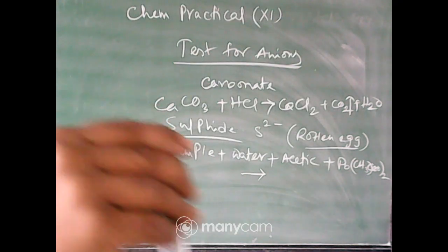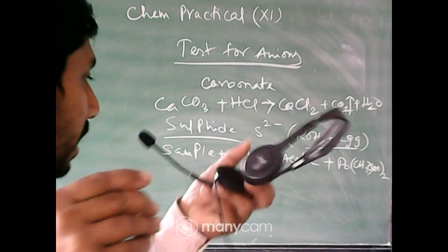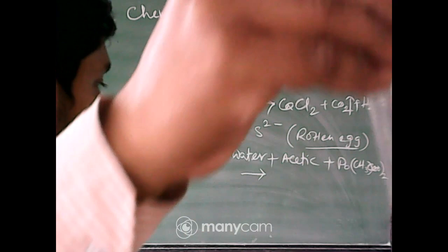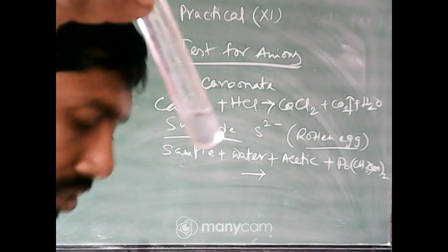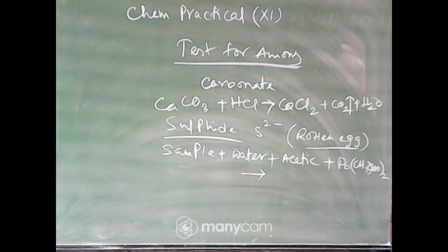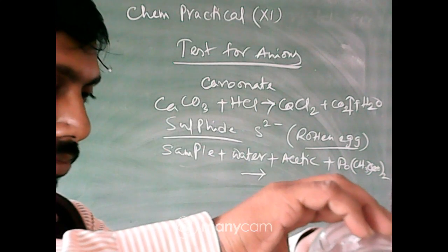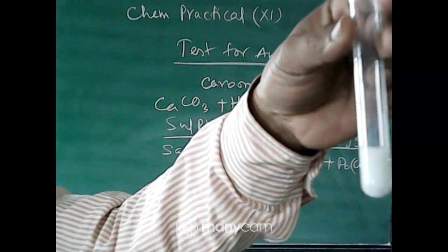Now here I will add acetic acid and then lead acetate. This is acetic acid. White PPT comes. You can see it.